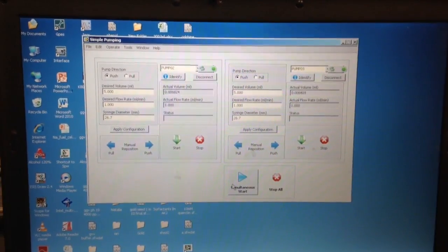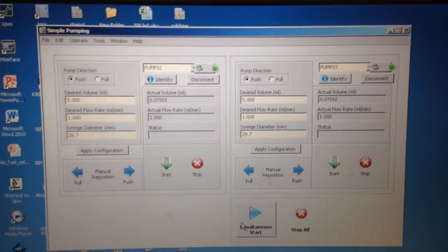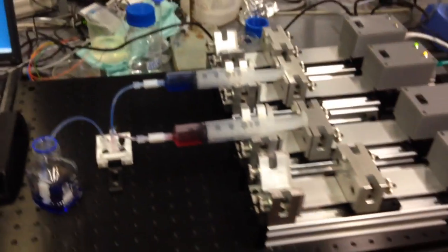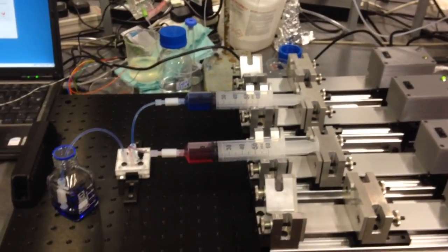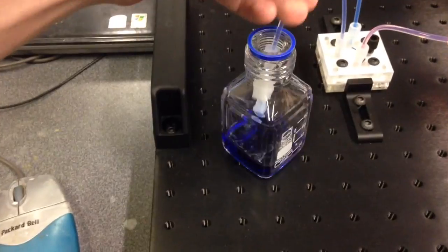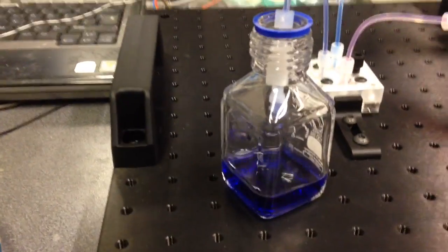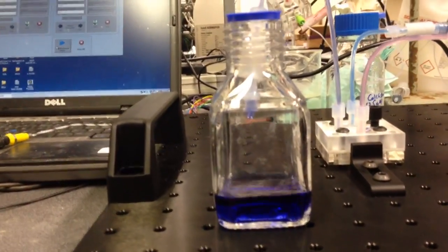As soon as we press start, liquid is flowing. You can see flow rates. If you look at the actual setup, we've got two syringes — one has a blue liquid, one has a red liquid. In the end, we expect to get violet. And this is what we get. Boom!